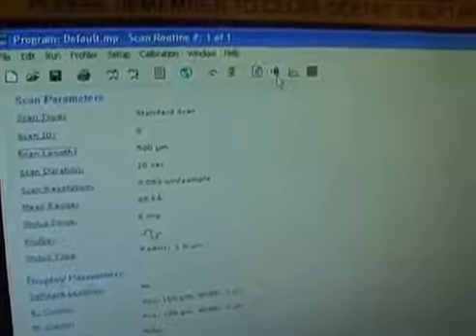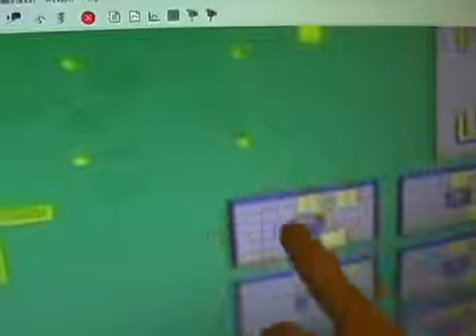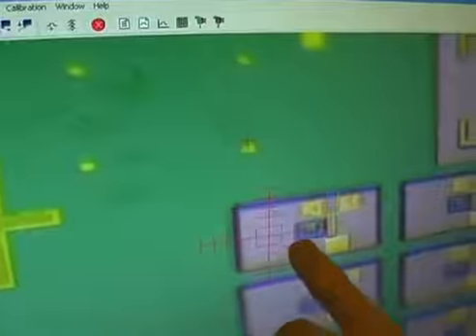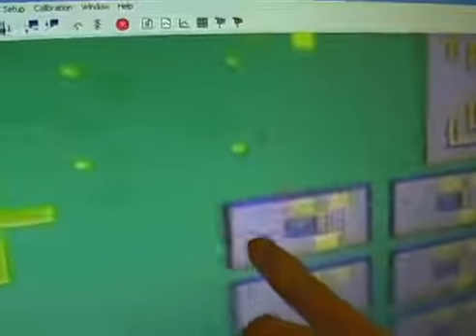We need to go back to the microscope by clicking this button. And now remember, we know that this point is where the tip will touch your sample. So we start from this point and we'll end at a length as you set, 500 micrometer, and we'll stop at this point.